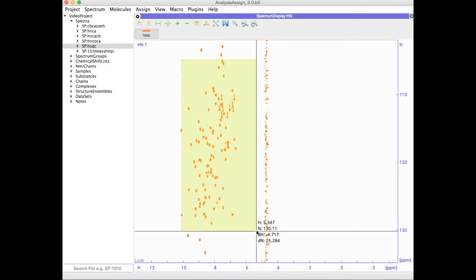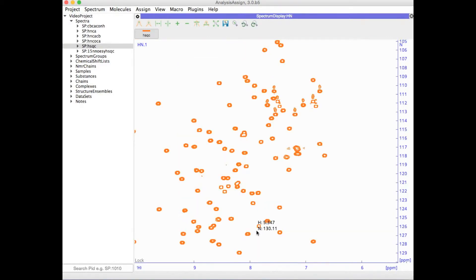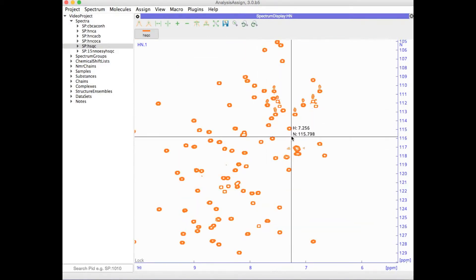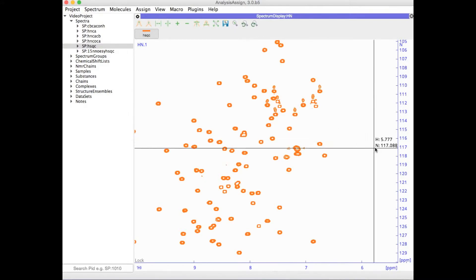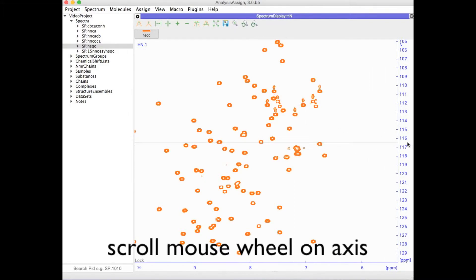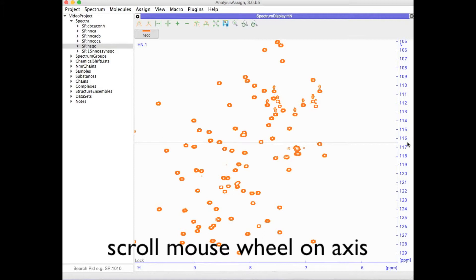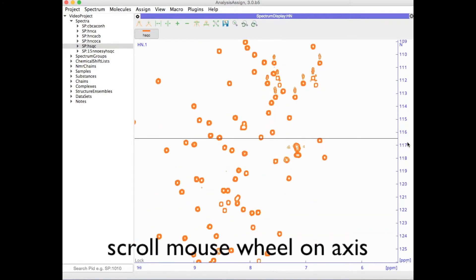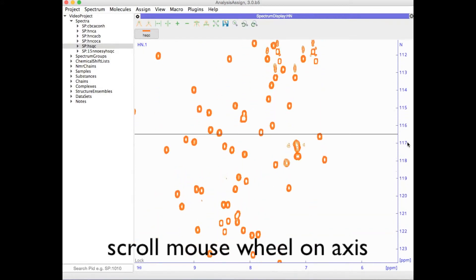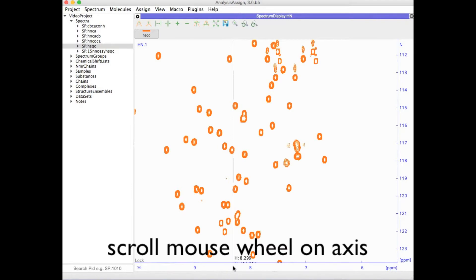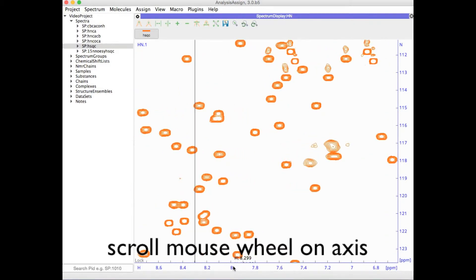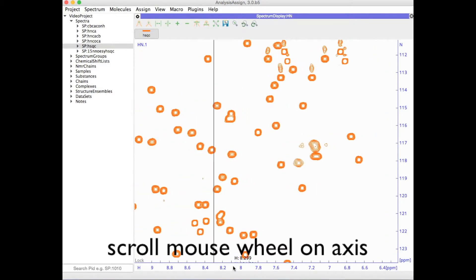You will notice that as I do an area zoom, the aspect ratio changes. You can also change the aspect ratio by using the mouse wheel on one of the axes. This effectively zooms selectively on that one axis and in the process changes the aspect ratio.